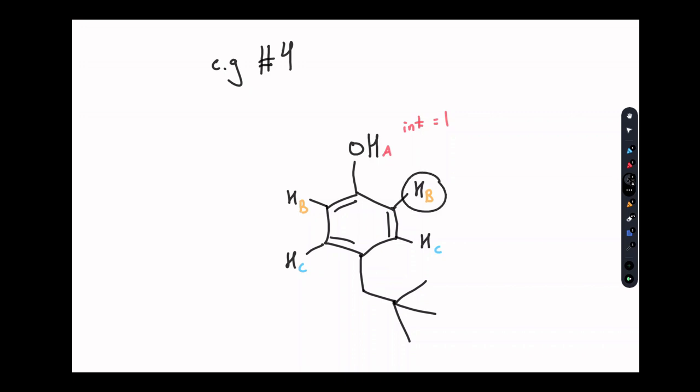However, why are these two the same? The answer is symmetry. This molecule is symmetrical, although this part doesn't look symmetrical. Remember that this can rotate. It's not really a factor. At the end of the day, try to justify any difference between these two hydrogens. Convince yourself that there's a difference, and it's very hard to.